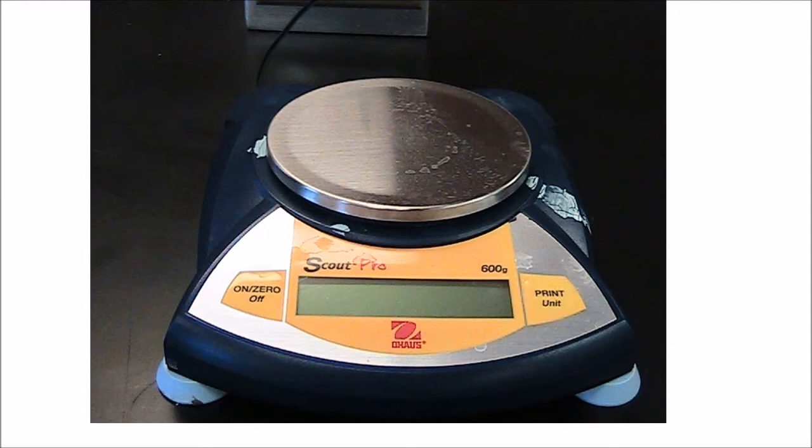These balances are not as accurate as the ones down the hall, but they are certainly adequate for what we're going to do today. You'll notice there are really just two buttons here: on, 0, off, and over on that side, print and unit. These are not hooked up to printers, so the print button doesn't matter. You might want to watch the unit button, because you always want to end up with grams. So let's take a look at how we're going to go about doing this.